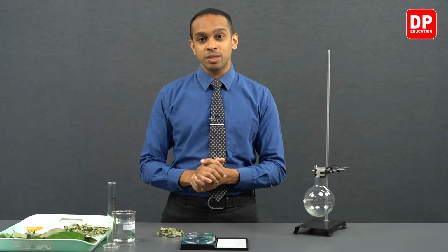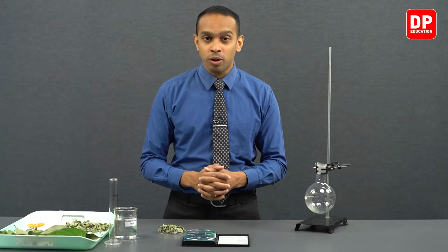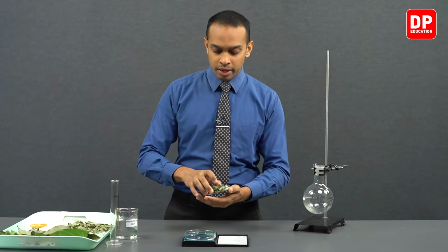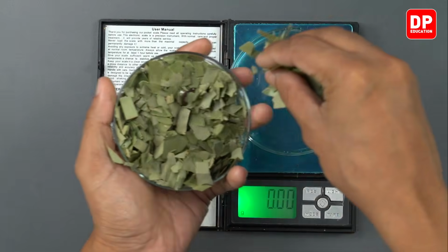However, when we are conducting this experiment, since we want to show you a considerable amount of the oil that is produced, we are going to double that amount and get 10 grams of cinnamon leaves so that we can produce a larger quantity of this essential oil. So let's measure 10 grams instead of 5 grams of cinnamon leaves.